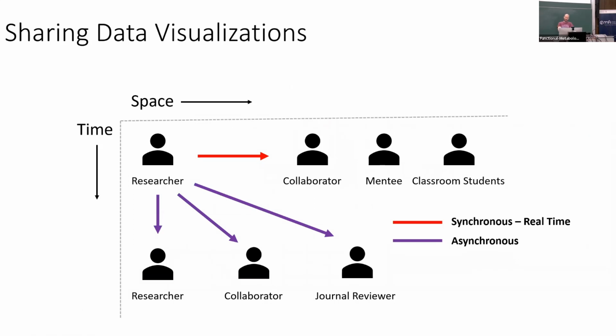Okay, so the visualization aspect is, I think, very nice and perhaps unique, as it's all in the web browser. You of course can share this with your collaborators, lab mates in the lab, but also with journal reviewers and readers.